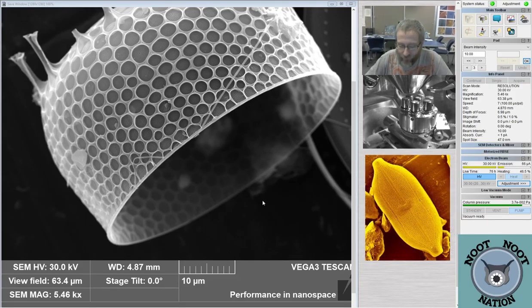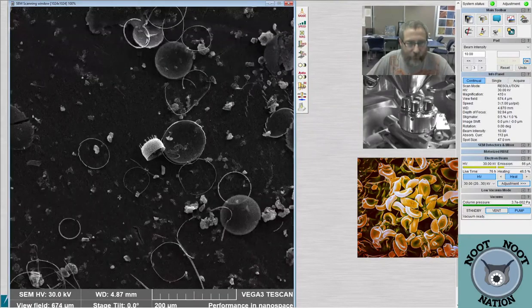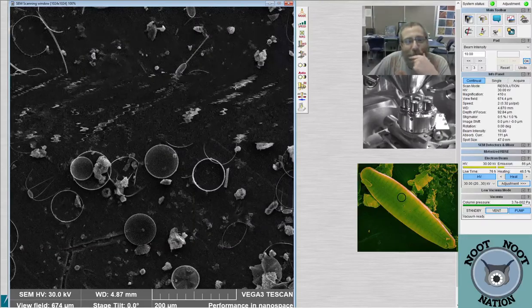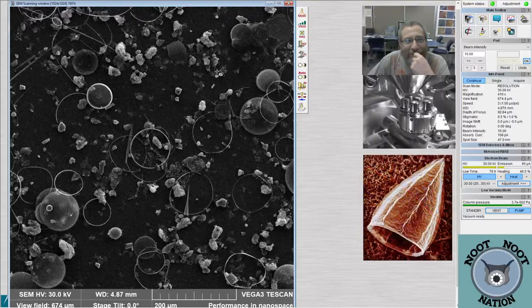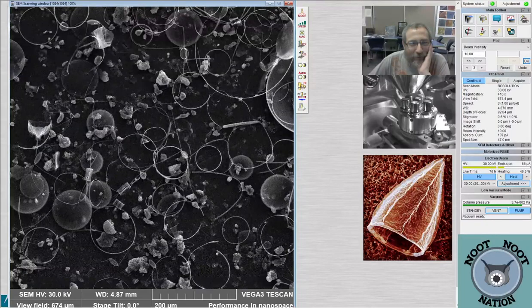This is Stephanopyxis. Stephanopyxis. All right. Not bad. Not bad at all. Really amazing. So cool. Sometimes I do okay work. You always do okay work. I want more. You want more work? I want less work. Well, is it really work if it's fun? No.